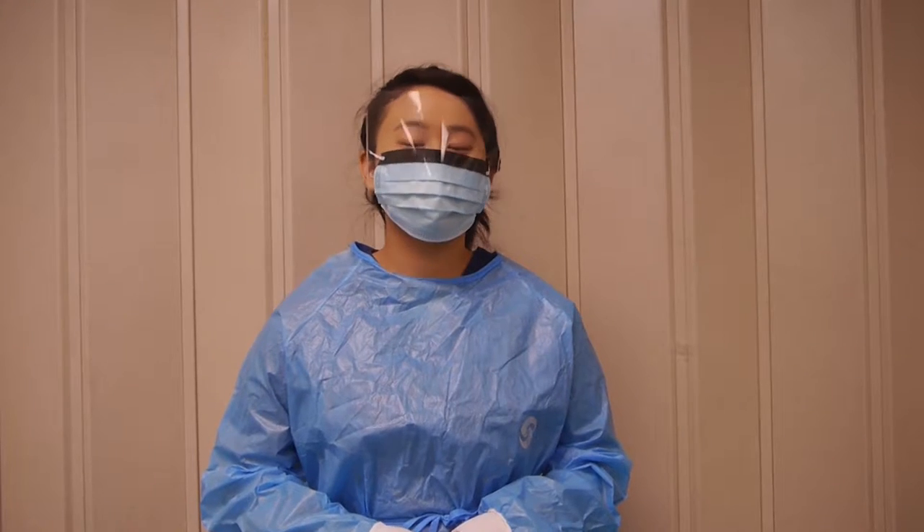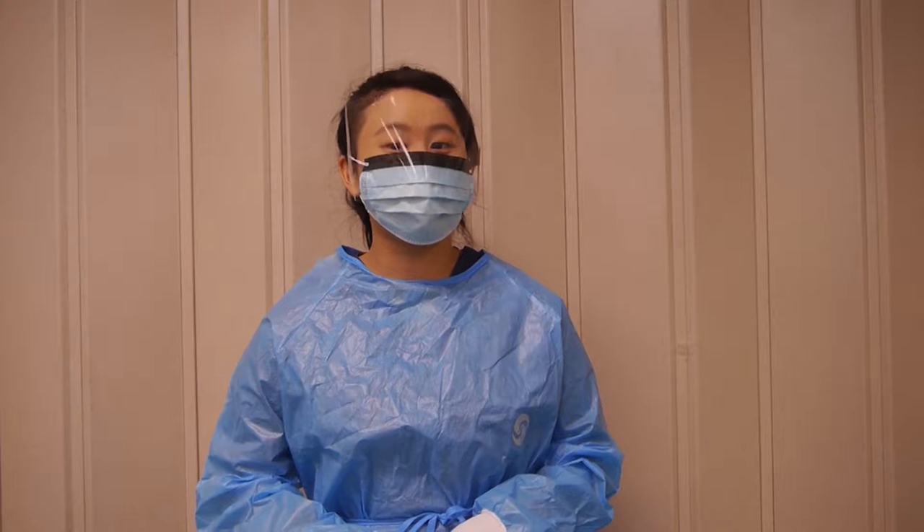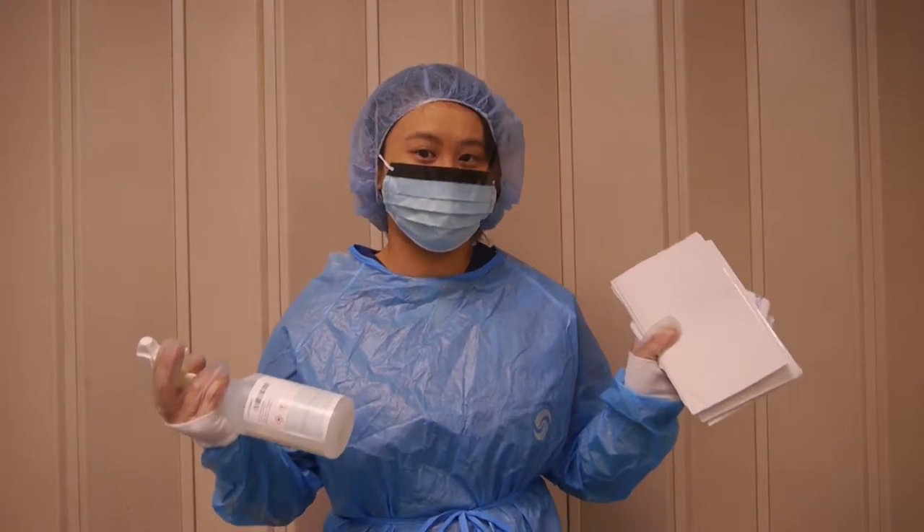After you put on your shoe coverings, you'll next need to put on your gloves. After your gloves, put on your protective gown covering. After your gown covering, put on your face mask. After your face mask, you'll finally put on your hair covering. After you put on your hairnet, you're ready to clean your LAF hood. Grab your wipes and your alcohol, and you're ready to go.